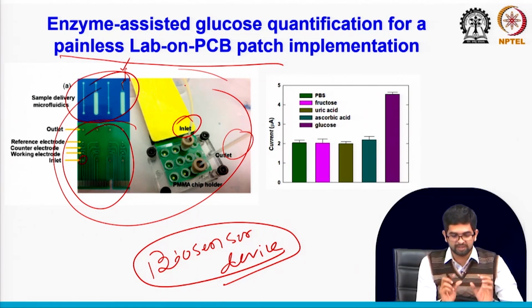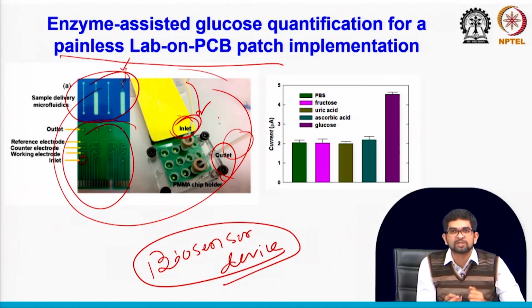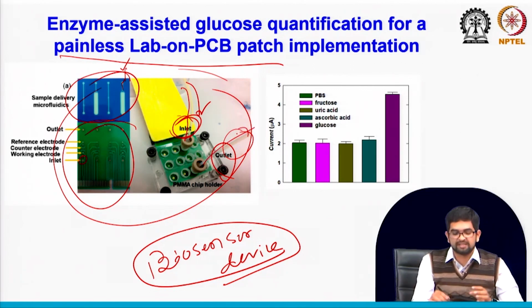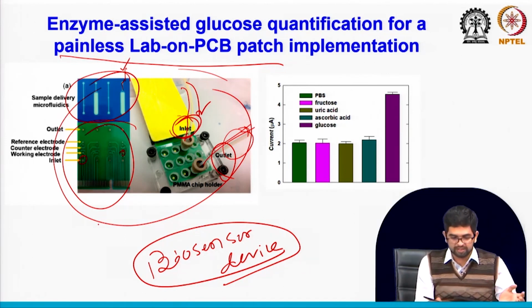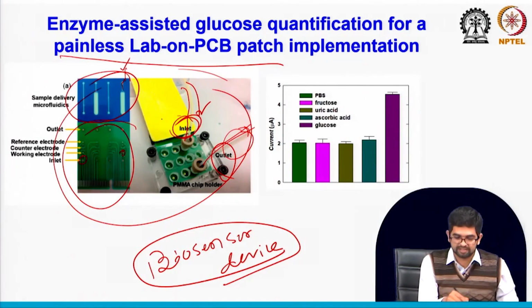A very miniature chip we develop using the PCB. Now let's use the inlet and outlet. In the inlet, you can make artificial sweat, and let's pass that artificial sweat through. Then from the outlet, all your excess artificial sweat can pass out, and you can check the concentrations of the different glucose. Then you may get similar data in this setup also. It means your PCB setup is ready for patch development.